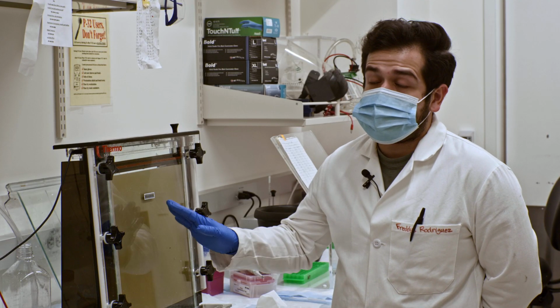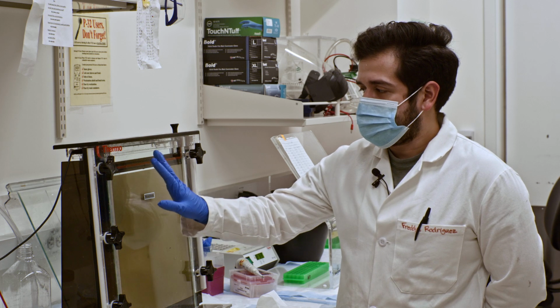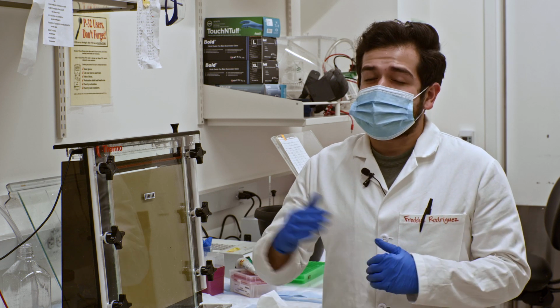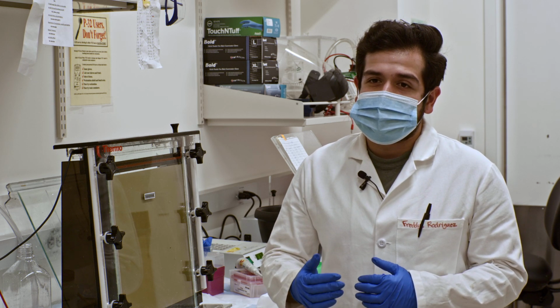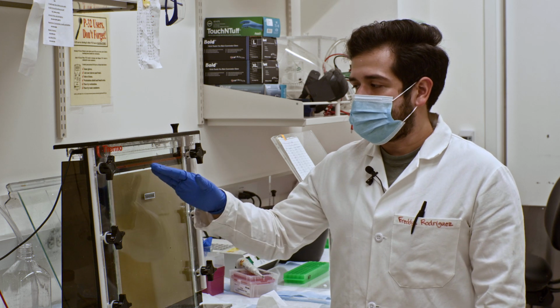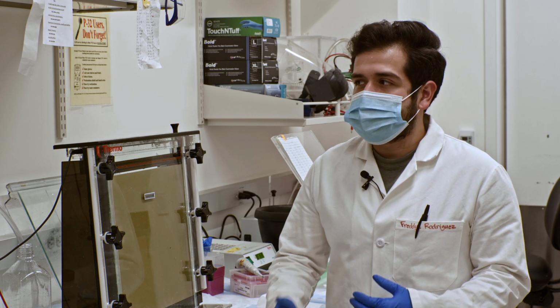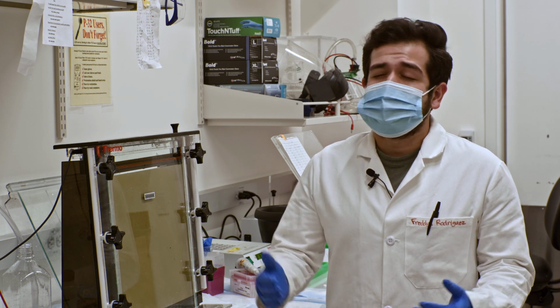The other thing about running the gel box hot is that it's better for your samples. You could, in theory, just run your samples on the gel cold, but two things tend to happen. If you run your samples cold, the separation may not be as good as if it were hot. Sometimes it streaks and it looks really bad when you phosphor image it. The second thing is that if you run your gel cold, your samples also tend to take a lot longer to develop. While running my samples on a hot gel might take 2.5 to 3 hours at this voltage, it may take anywhere from 4 to 5 hours on a cold gel. Since this assay is already quite long, you might as well save yourself a couple of hours.